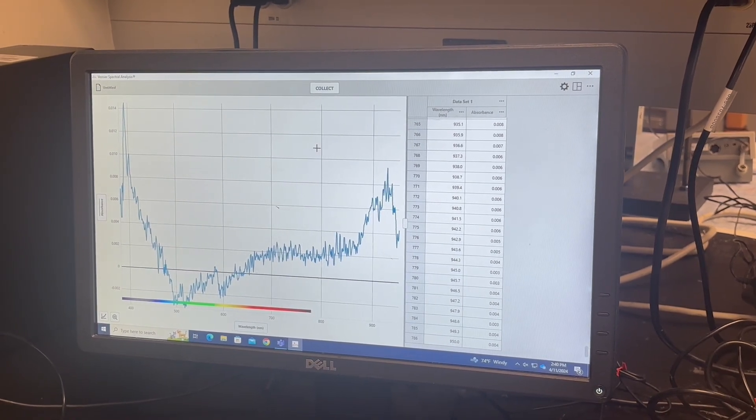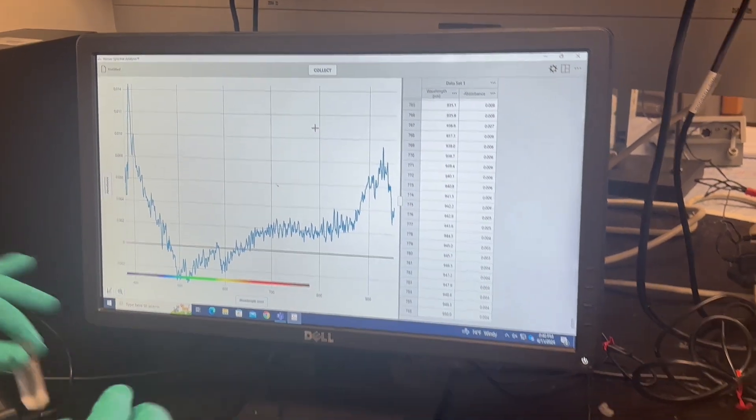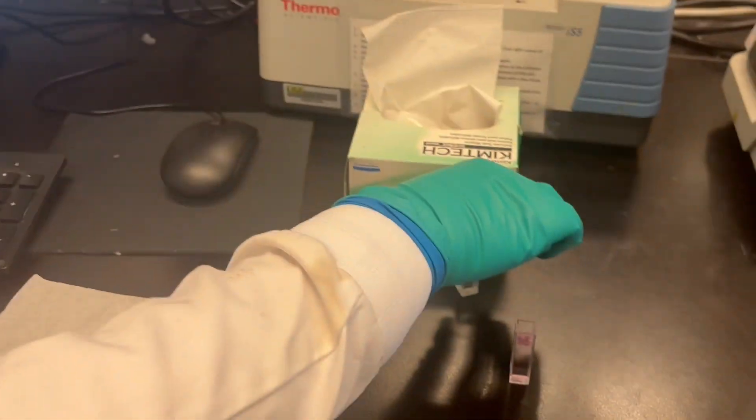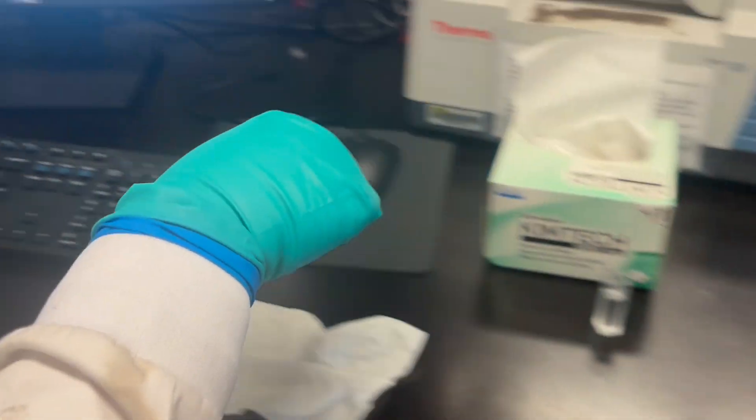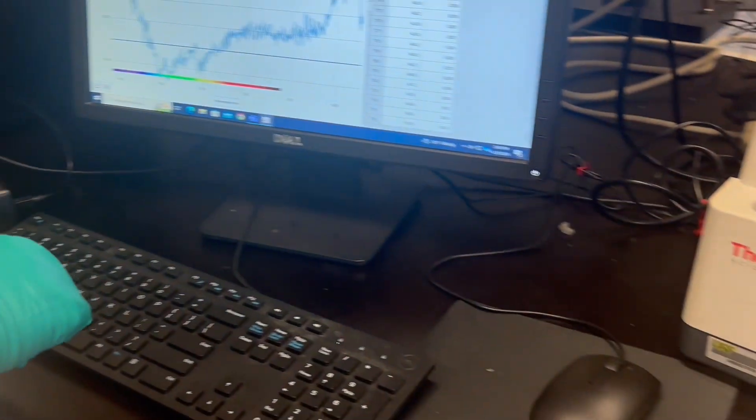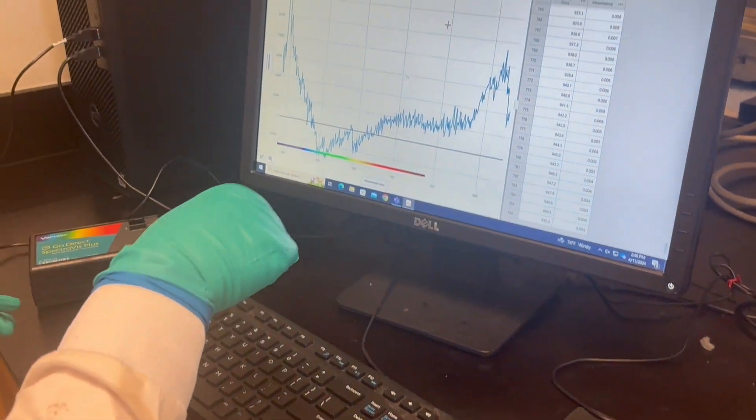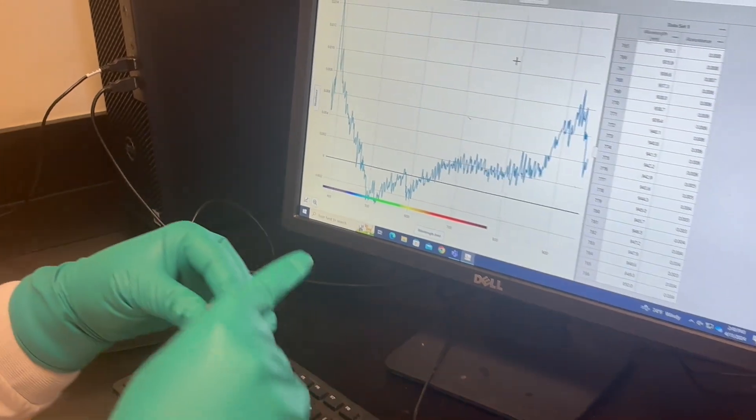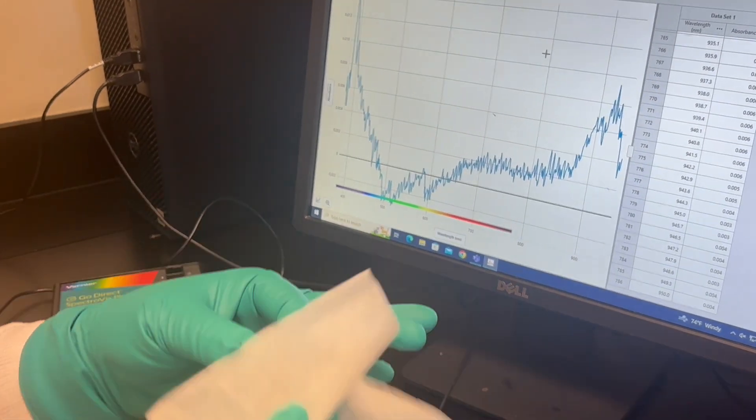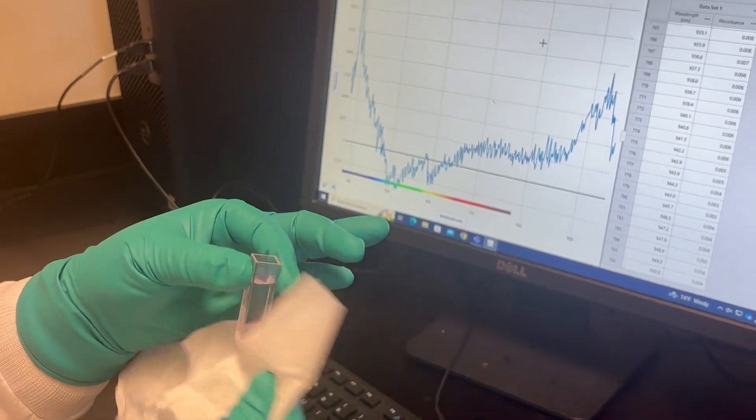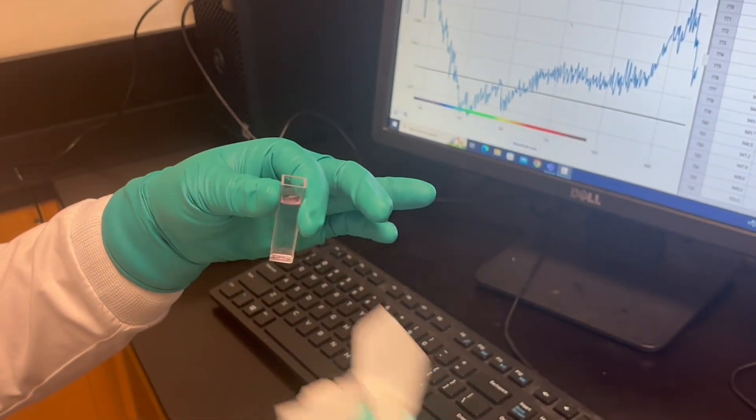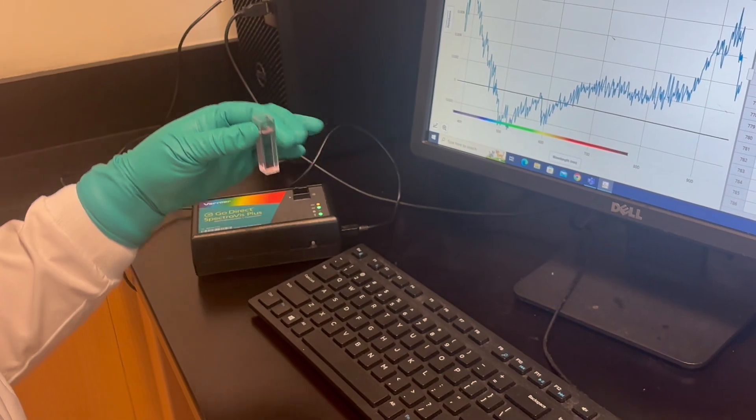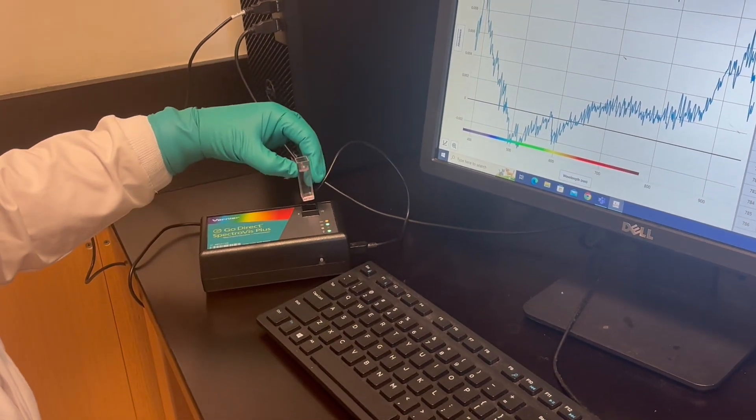And then we'll add our sample in. So here is our sample. Make sure you know where you're expecting your first peak. Wipe it down with the Kimwipe. And then line up the arrows again.